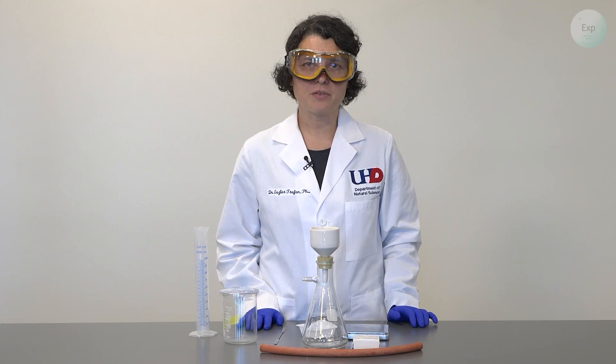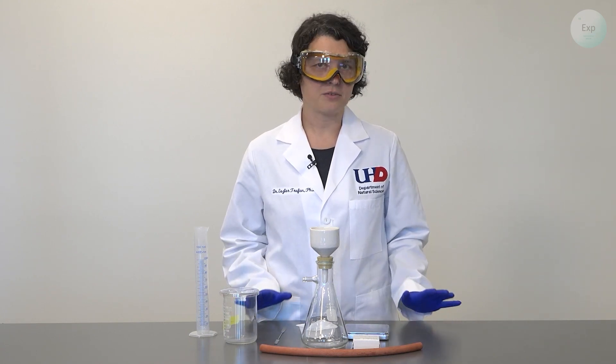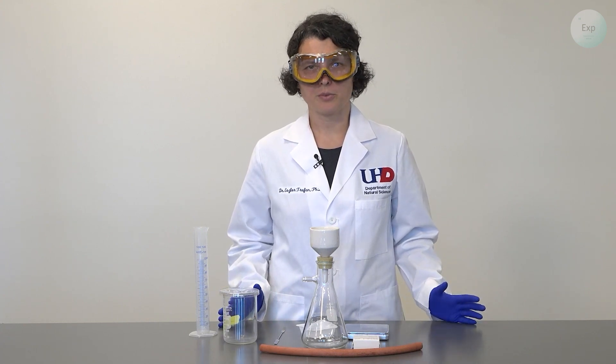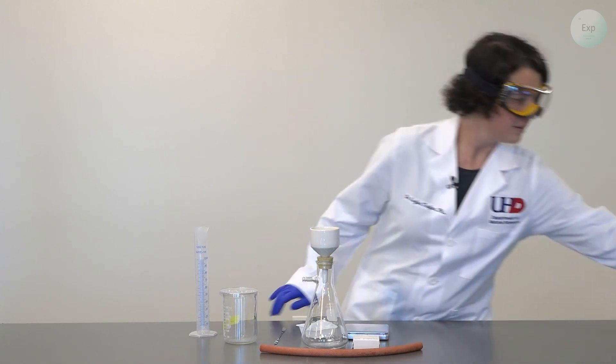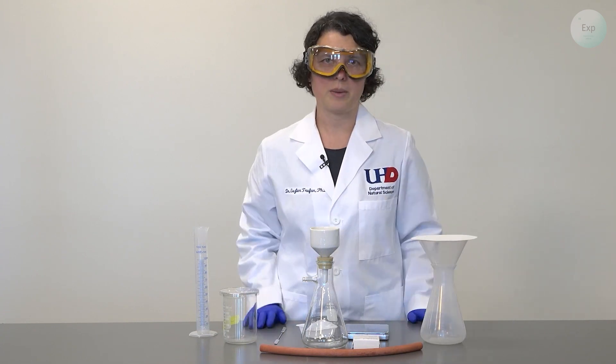Should you go the gravity filtration route, you're going to need, depending on your conditions, different materials. You can use a stand with a ring, a funnel, filter paper, and a beaker, or you can use a makeshift option that you can do at home, and that will include an Erlenmeyer flask with a funnel and a fairly large filter paper.